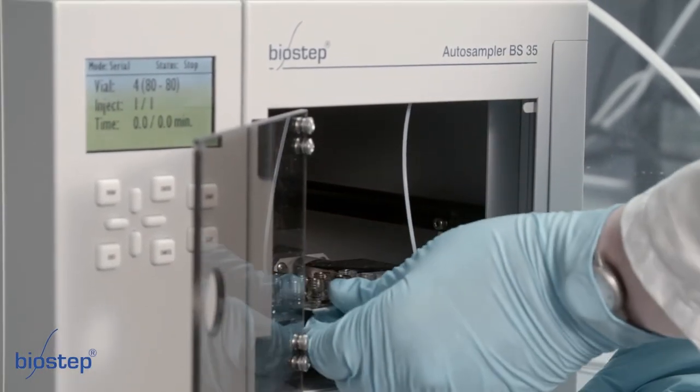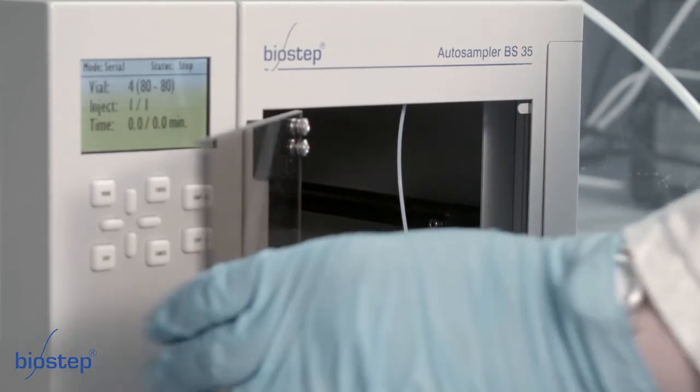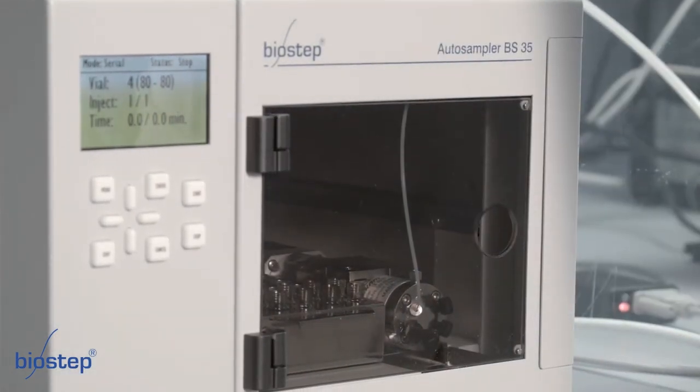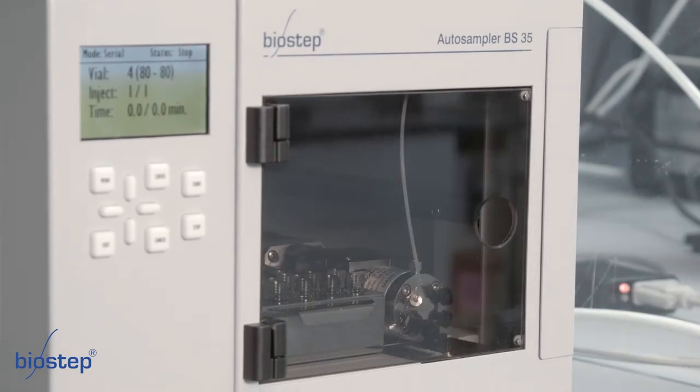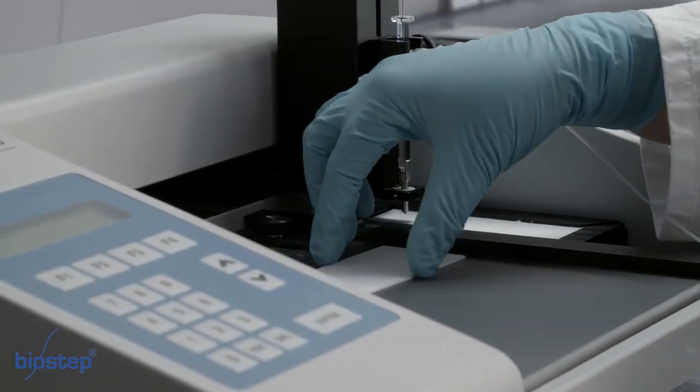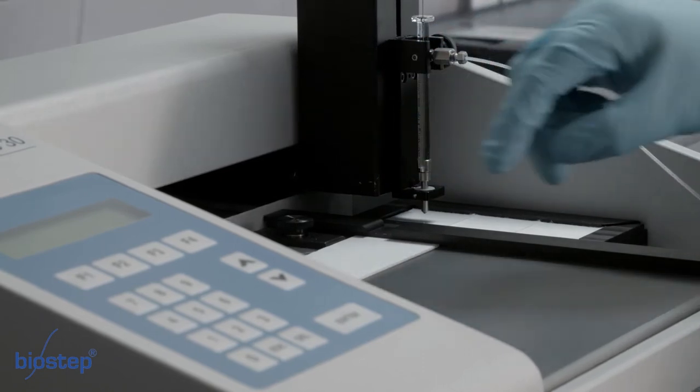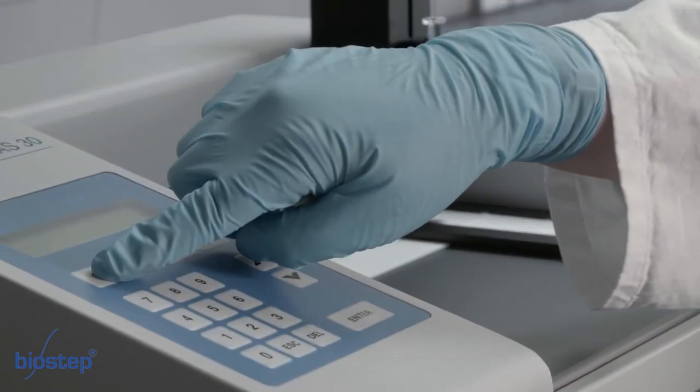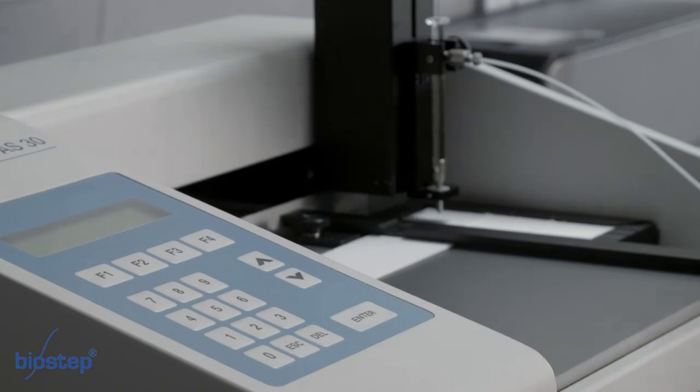Put the rack in the auto-sampler. There is only one way to position the same. The pins at the bottom have to fit with the holes in the bottom of the auto-sampler. Now position the TLC plate on the applicator. Start the program at AS30. The TLC plate will automatically be fixed.